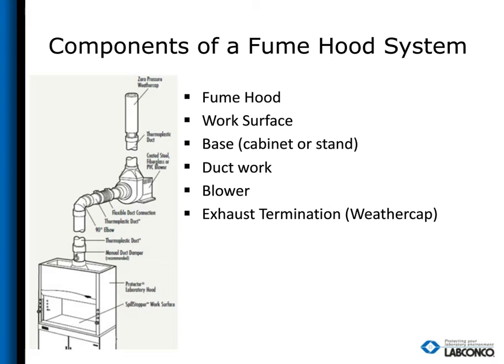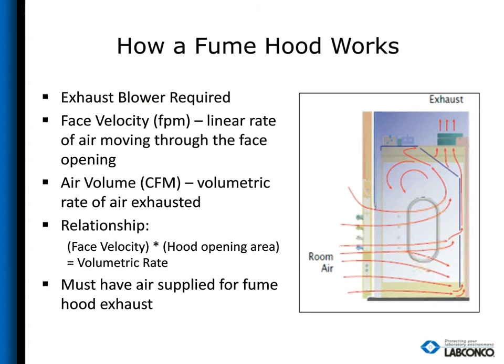And per the ANSI Z9.5 standard, it needs to terminate 10 feet above adjacent roof lines, and it needs to be in a vertical up direction, so those vapors will be carried away in the trade winds. So now we have our fume hood set in place, completely installed, and we want to get it up and running. Here's how a fume hood actually works.